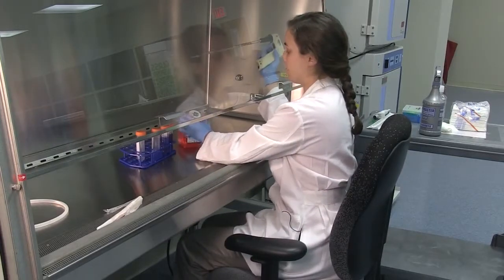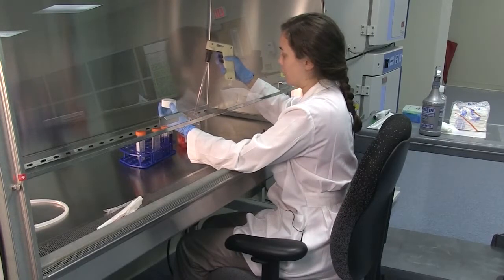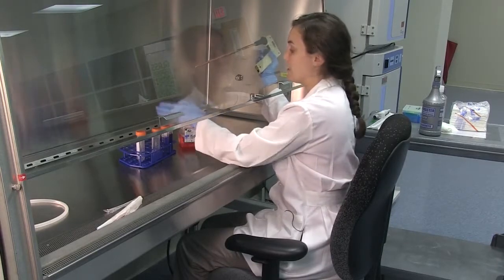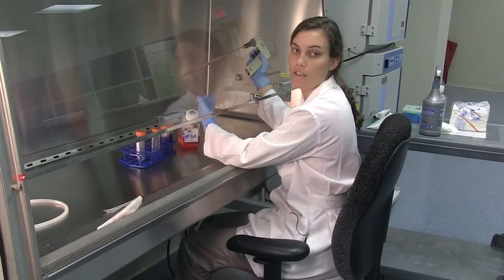Now that the media bottle is open, use one hand to take off the cap and the other to draw out the media. When you're finished, put the cap back on. It's important not to pass over the top of the media bottle or any open container without the lid on, as this can cause contamination.